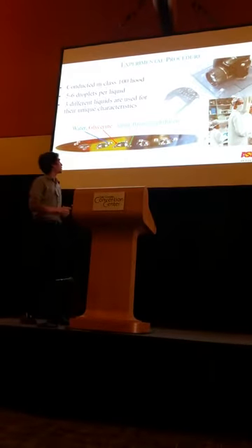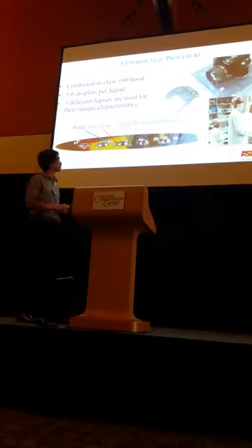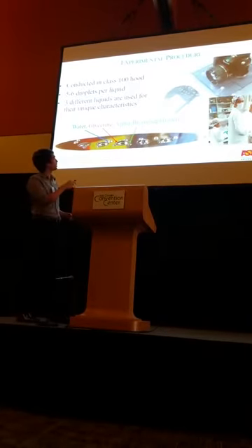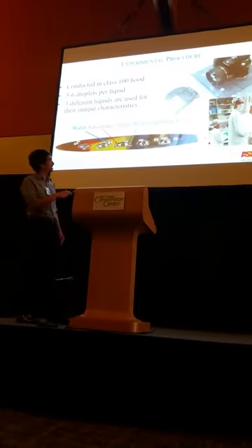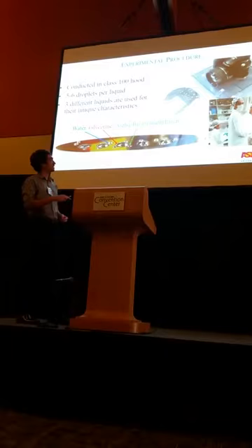So how do we set up our experiment to test our hypothesis? Our experiment was conducted in a class 100 hood with proper PPE and well-cleaned equipment. You can see here on the top right an image of our silicon wafer with our droplets placed upon it and our camera for recording these results. Down here is an image of myself and a couple of my co-authors, conducting 3LCA under our class 100 hood with our proper PPE.